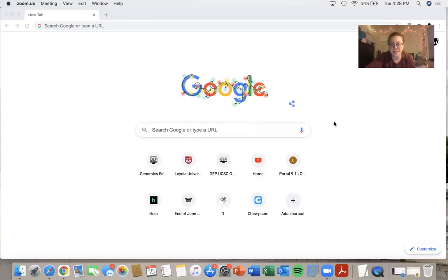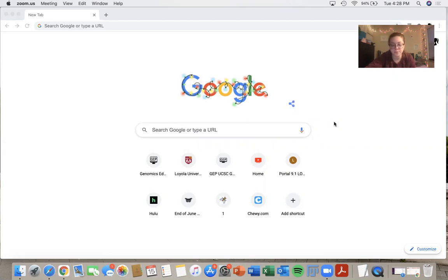Hi, my name is Claire and I'm a TA for the GEP. Today I will be walking you through how to use the sequence updater.